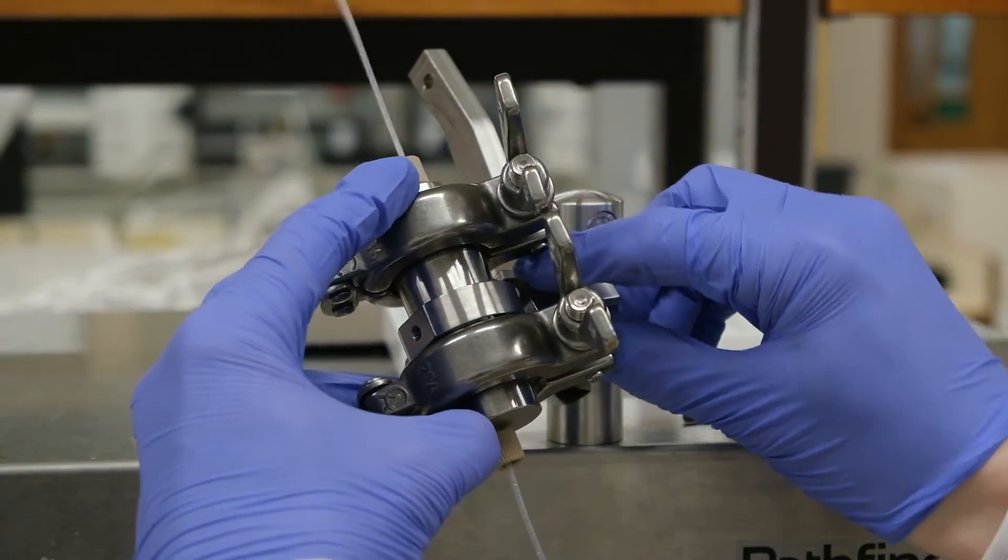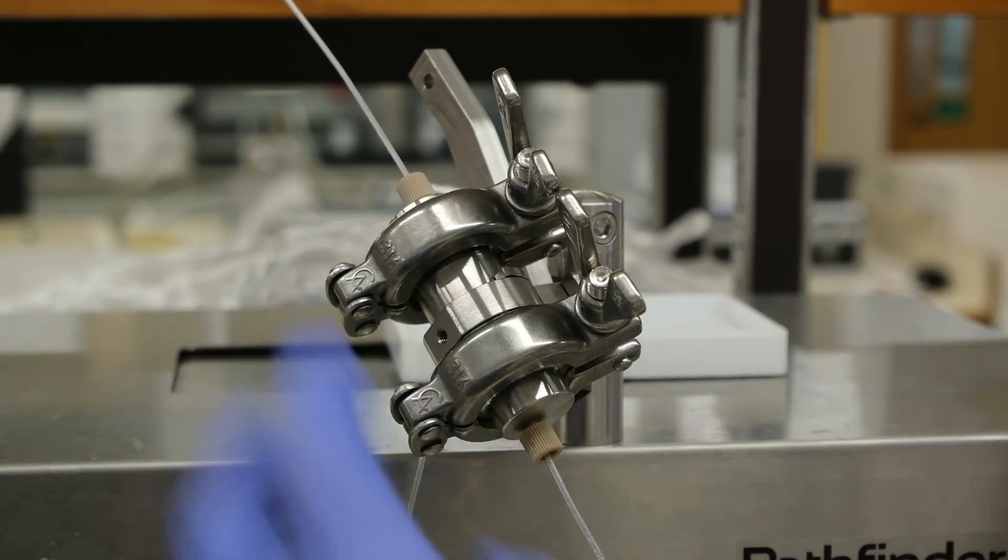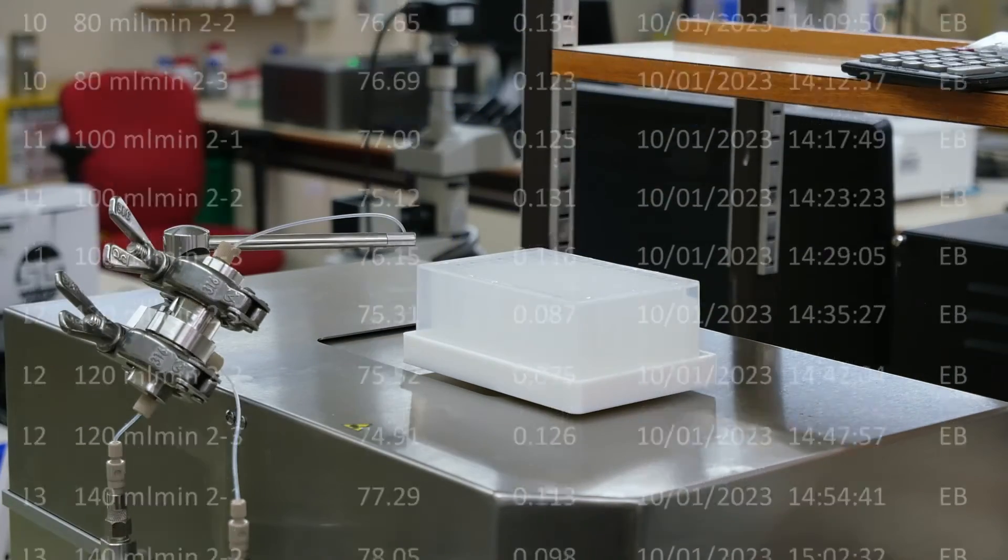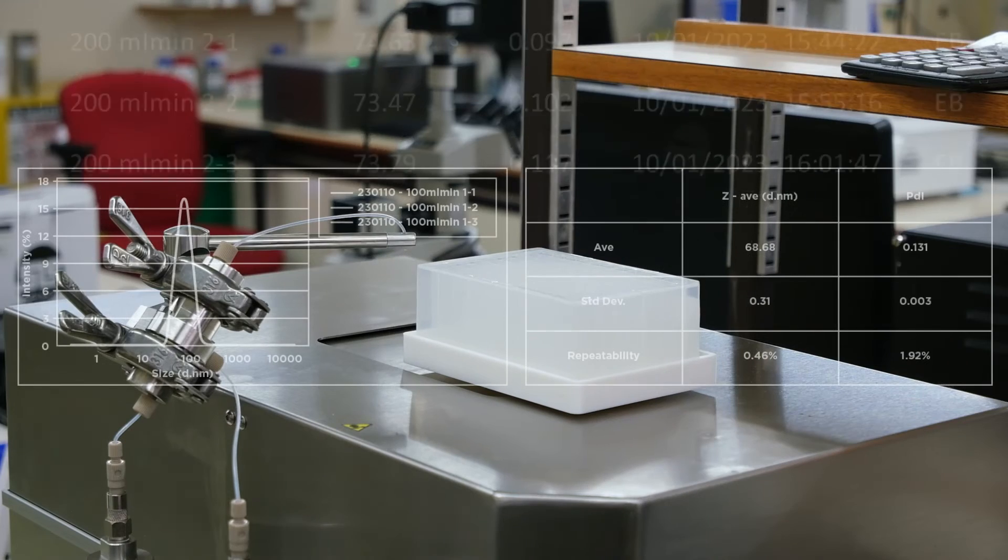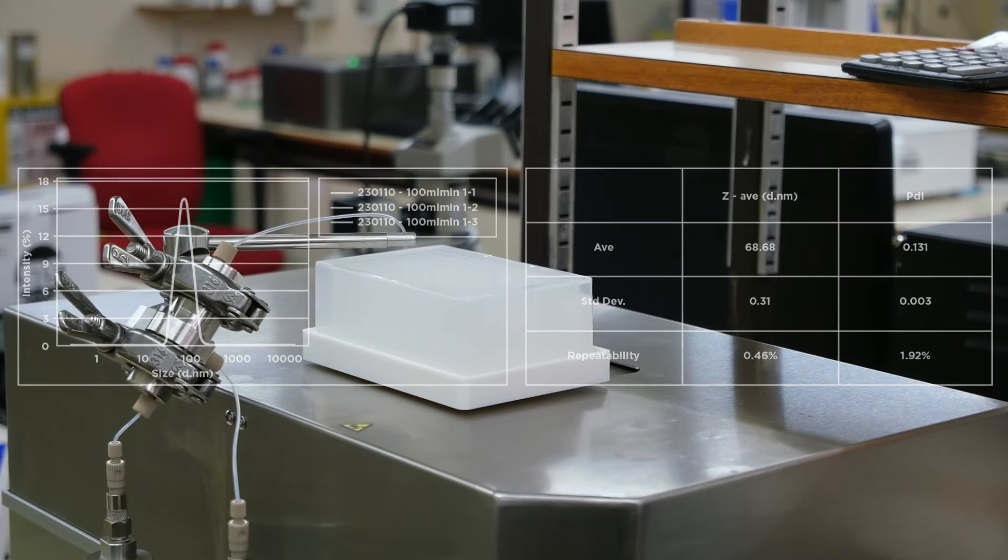The Pathfinder screens formulations into a programmable multi-well plate, producing aliquots as small as 200 microlitres. This can be increased to single samples of up to 250ml on the Pathfinder Pro 250 model.